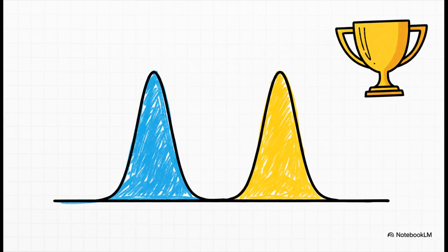And this is the goal. This is what we are all aiming for. Look at that. You've got sharp, symmetrical peaks with tons of clean baseline between them. That, my friends, is high resolution. It's clean, it's quantifiable, and it's the beautiful result you get when you actually understand and apply the theories we've been talking about.